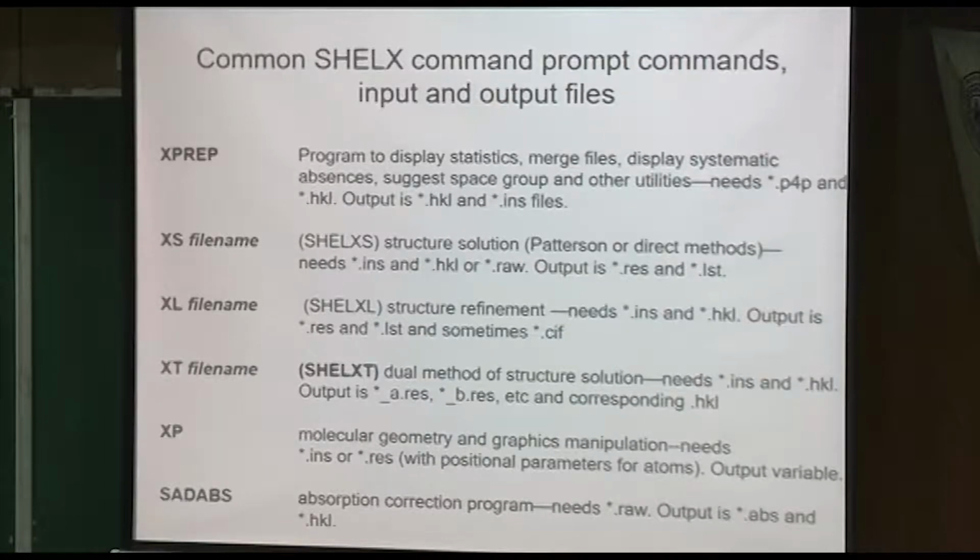It doesn't change the HKL. To tell you the truth, hardly anybody uses that anymore because there's this new program called SHELXT. Have y'all used SHELXT? It's like magic. It works so well that you almost never need to use direct methods or Patterson methods. Yes, you heard of it? Okay, yeah. So it's only been around for 3 years, XT. And I was one of the beta testers for it.